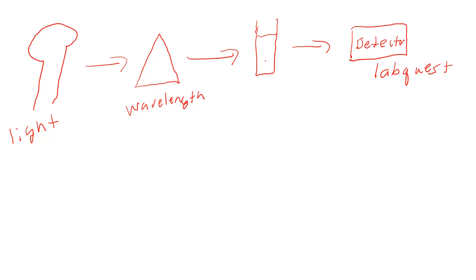So you're going to take a stock solution of 0.50 molar copper sulfate, and you're going to dilute it using the values given in your lab handout. So for example, in trial 1, you're not going to put any stock solution, and you're going to have 6 milliliters of water. In trial 2, you're going to put 2 milliliters of copper sulfate and 4 milliliters of distilled water. So 2 milliliters plus 4 milliliters gives us a total volume of 6 milliliters. Now we are assuming the volumes are additive, which they are technically not, but for our purposes it's close enough that it's not going to affect our calculations.